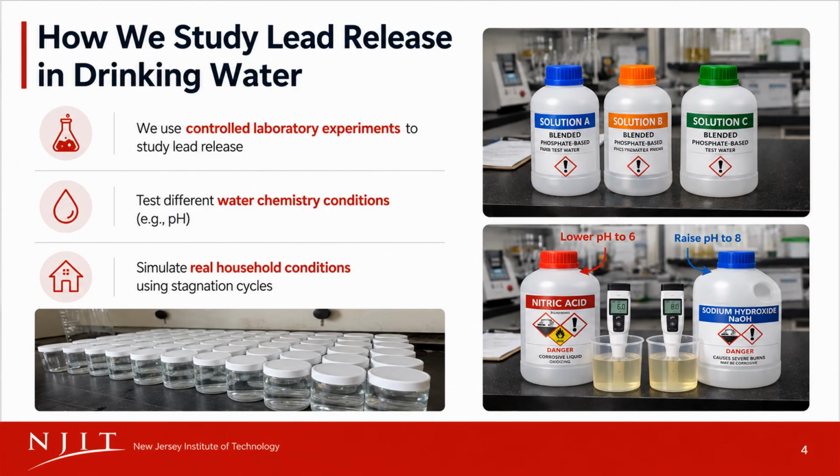We also used the stagnation cycle because in real homes, water often sits in the pipes for several hours before someone turns on the tap. So instead of looking at just one sample, we tracked lead release over time. That helped us compare how the treatments behave under different water chemistry conditions.